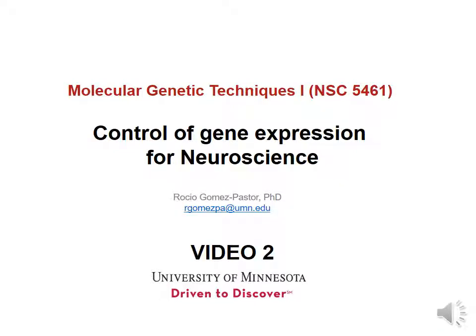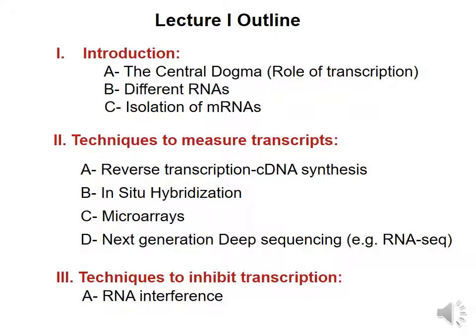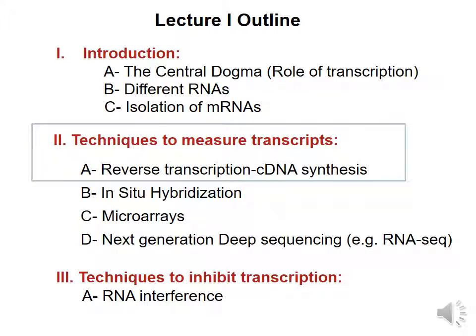This is the second video of the Control of Gene Expression for Neuroscience lecture. In this video, we will talk about techniques to measure transcription. Within the outline of the entire lecture, as I mentioned earlier, we will talk about techniques to measure transcript, specifically focusing on the reverse transcription and cDNA synthesis.